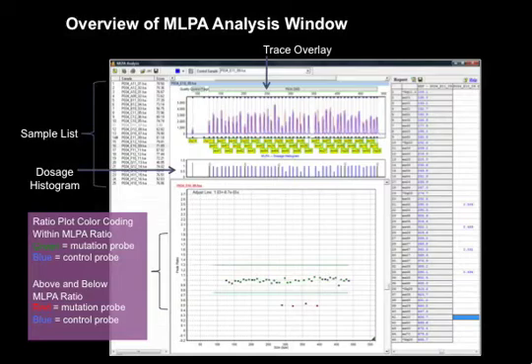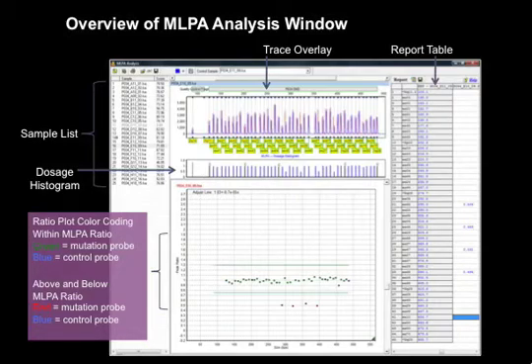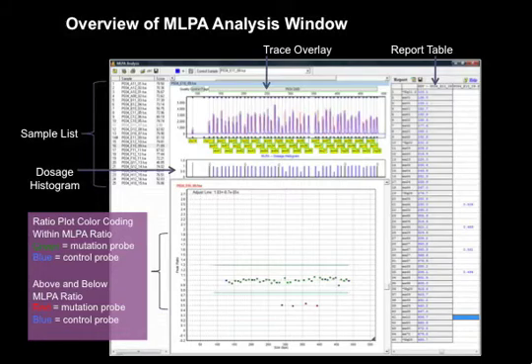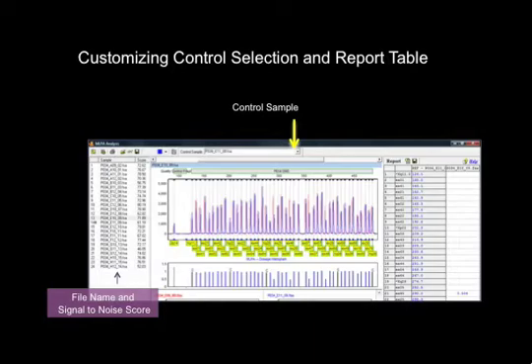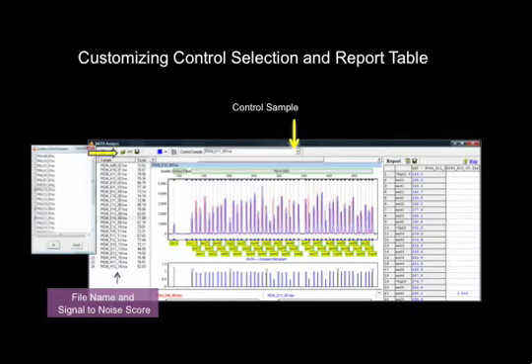Green equals a mutation probe within the MLPA ratio. Red equals a mutation probe outside of the MLPA ratio. To the far right side of the MLPA analysis screen is the linked report table listing the probes, reference sample, peak sizes, and experimental samples. The current report table selection is set to display loss or gain in the report. The control sample is listed at the top — this is the sample with the least variation. If desired, analysts may use the drop-down menu to change the control sample, or select the control icon to activate a pop-up box and select files to use in a synthetic control.